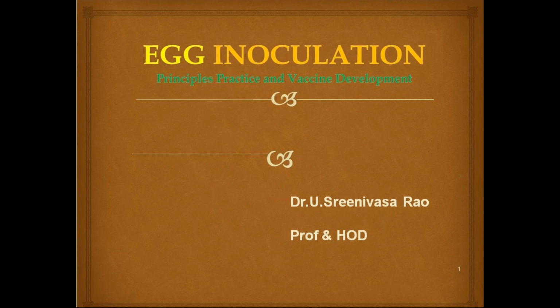Good morning, everybody. Today, we are going to discuss the practical applied exercise, egg inoculation. What is the importance of egg inoculation in virology? Egg inoculation is nothing but growing the viruses in embryonated eggs.